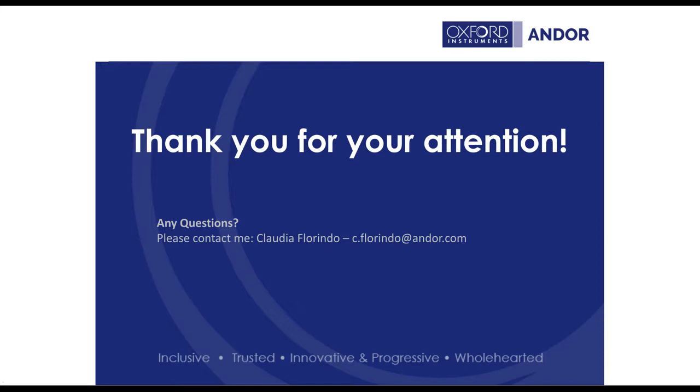For the multiplex imaging, the interaction is done by the REST API interface, which is incorporated into the Fusion software. So the external devices can be controlled by an external program that can be driven by Python, LabVIEW, or MATLAB, and this provides the ability for Fusion to communicate, for Dragonfly to communicate, with the microfluidic devices through Fusion and to proceed to the multiple rounds of imaging and washing, integrating with the microfluidic system.